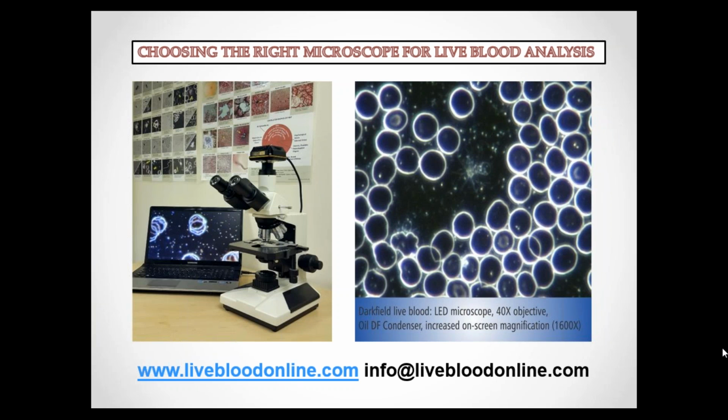There was actually a hematologist and pathologist during the 1960s and 70s that really supported the use of phase contrast and dark field in viewing live samples, and he tried to encourage pathologists to use this technique because he believed there's a lot of value in looking at samples while they're still alive instead of looking at samples once they've been killed off by all these stains and chemicals that are used. Absolutely. Okay, thank you for that.